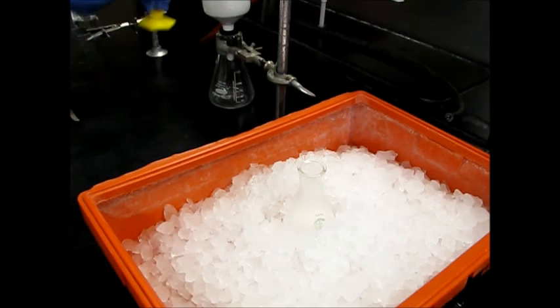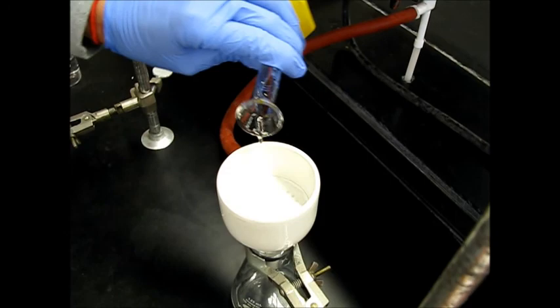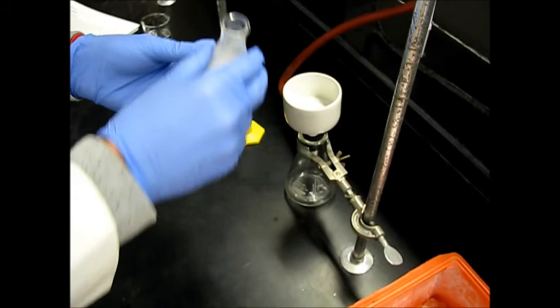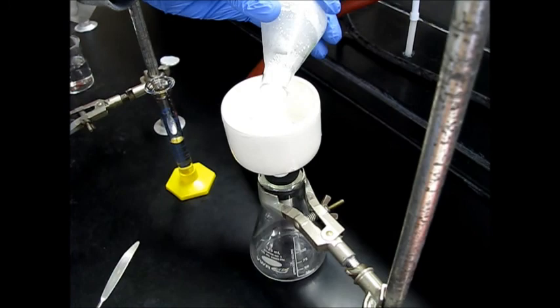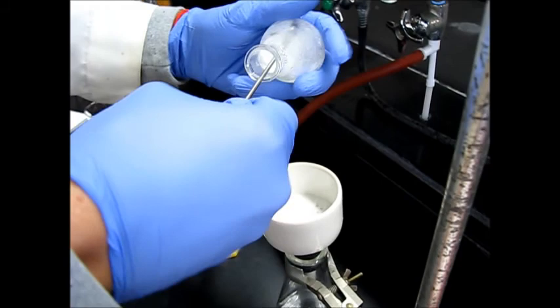We're going to wet our filter paper using water. Just to get a good seal. Then we're going to pour our product into here. Then we can scrape out anything stuck.